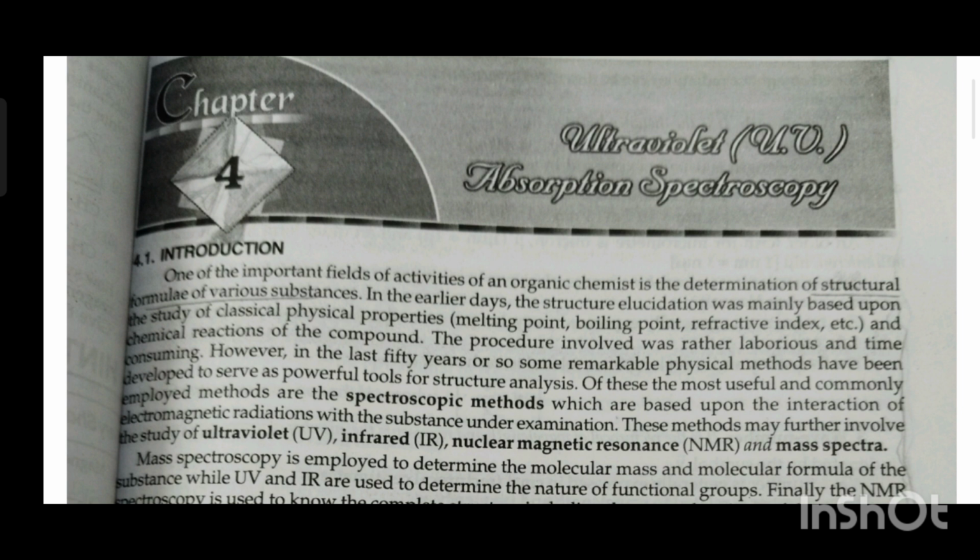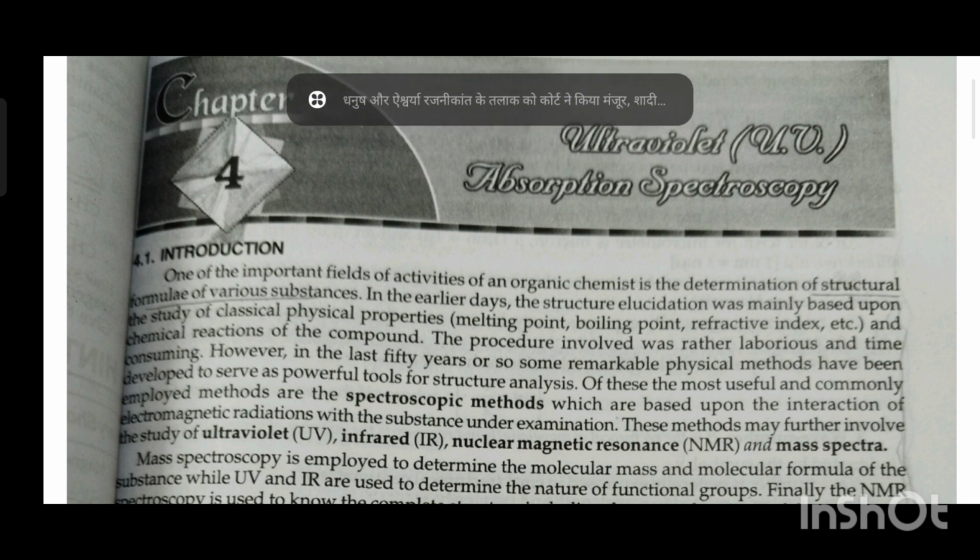However, in the last 50 years or so, some remarkable physical methods have been developed to serve as a powerful tool for structural analysis. Of these, the most useful and commonly employed methods are the spectroscopic methods, which are based upon the interaction of electromagnetic radiation with the substance under examination.